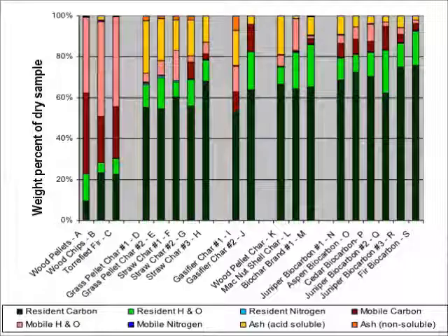So what we did, well, first off, we looked at a bunch of stuff. And again, you're seeing here, the pinks are the mobile fractions. We've actually added both the carbon piece versus the non-carbon portion in the organics. And you see with your wood feedstocks on the one side, these things are highly mobile. But even this test, the way you'll see it's done on this one, is creating some resident matter out of your char. Well, guess what? You take biomass and heat it. In this test, you'll see, it heats to 450C, you make some of it into char. So all this test really did when it did this partitioning was take your stuff and make it from biomass to biochar and tell you what your yield was.